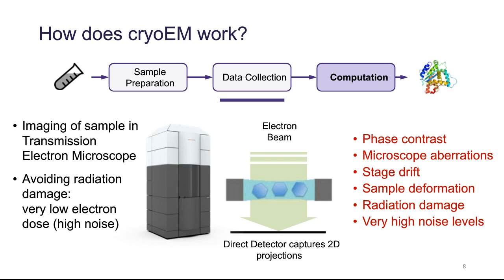These characteristics of the data mean that huge amounts of data must be collected and passed on to the computational stage in order for 3D reconstruction to be possible. It's typical to collect several thousand micrographs containing several million particles for a single target in CryoEM.